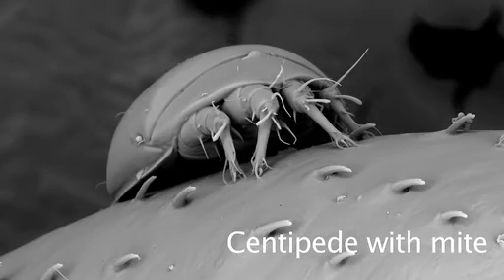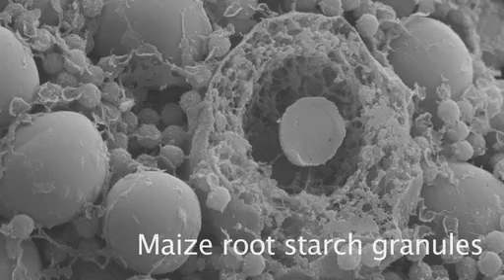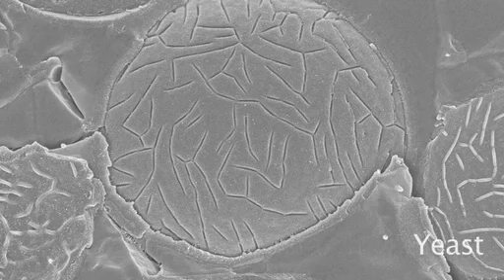Combining unparalleled ease of use with superb results, the Quorum 3010 truly sets the standard for cryopreparation.